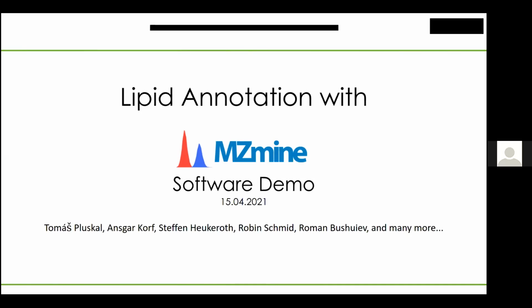Before I start, I'd like to mention that I'm not the main developer of this software. MZmine is really a community open source project, and I'm just one of the developers for the last few years. A lot of the work I will show today is mainly done by Tomasz, the head of the project, but also by people like Steffen Heukeroth, Robin Schmidt, and Roman, and many, many more. I will definitely miss a lot of people today, but just so you know.